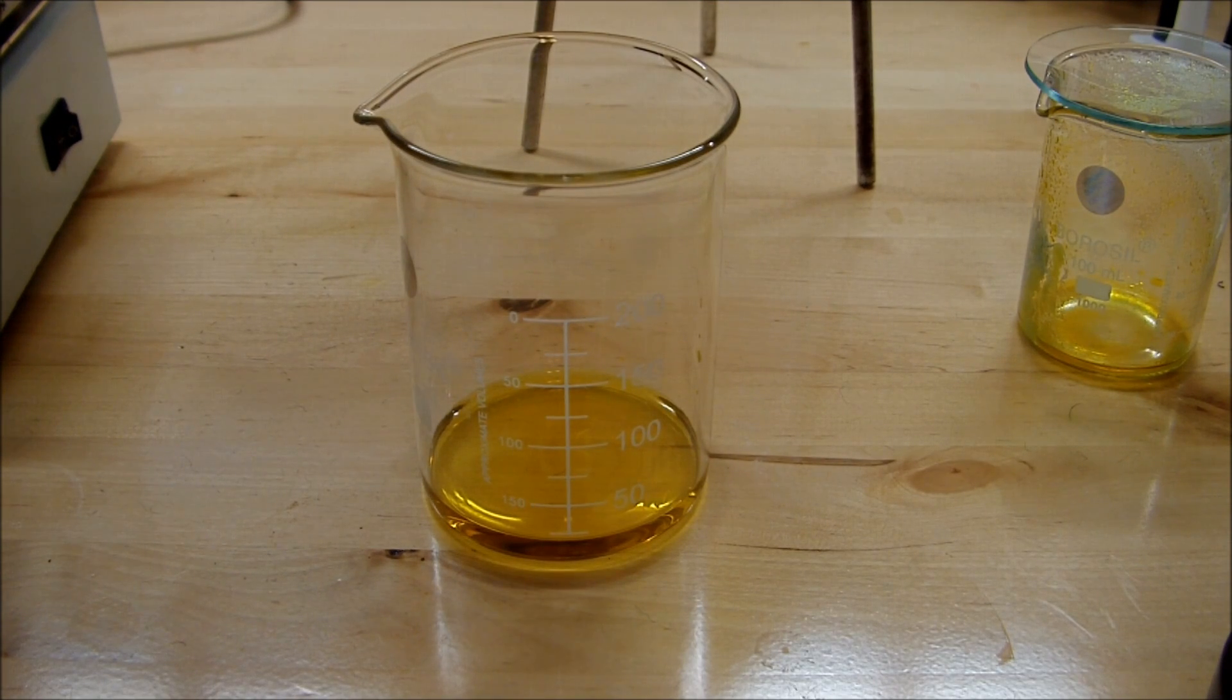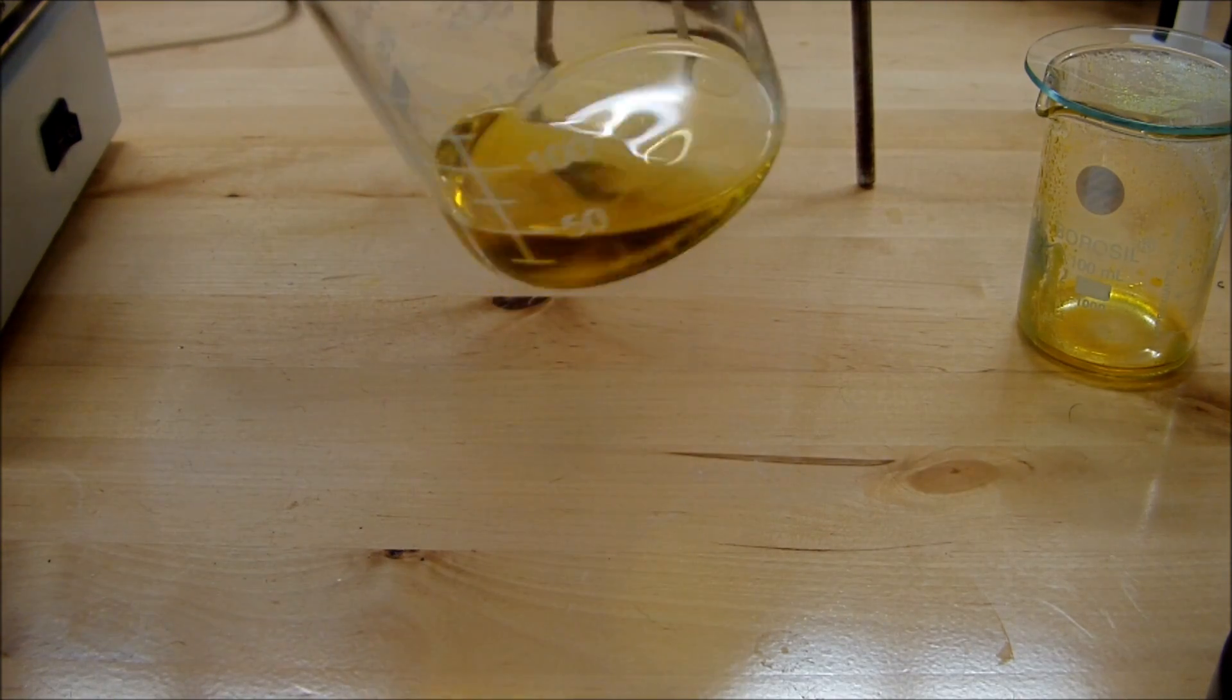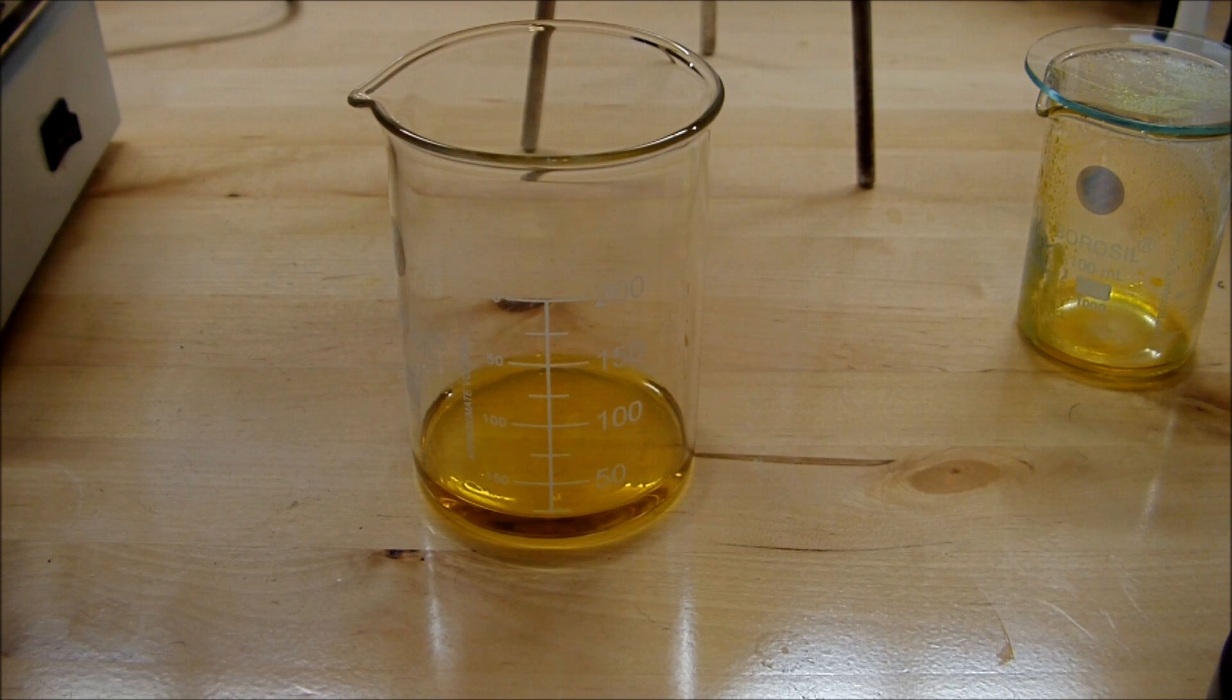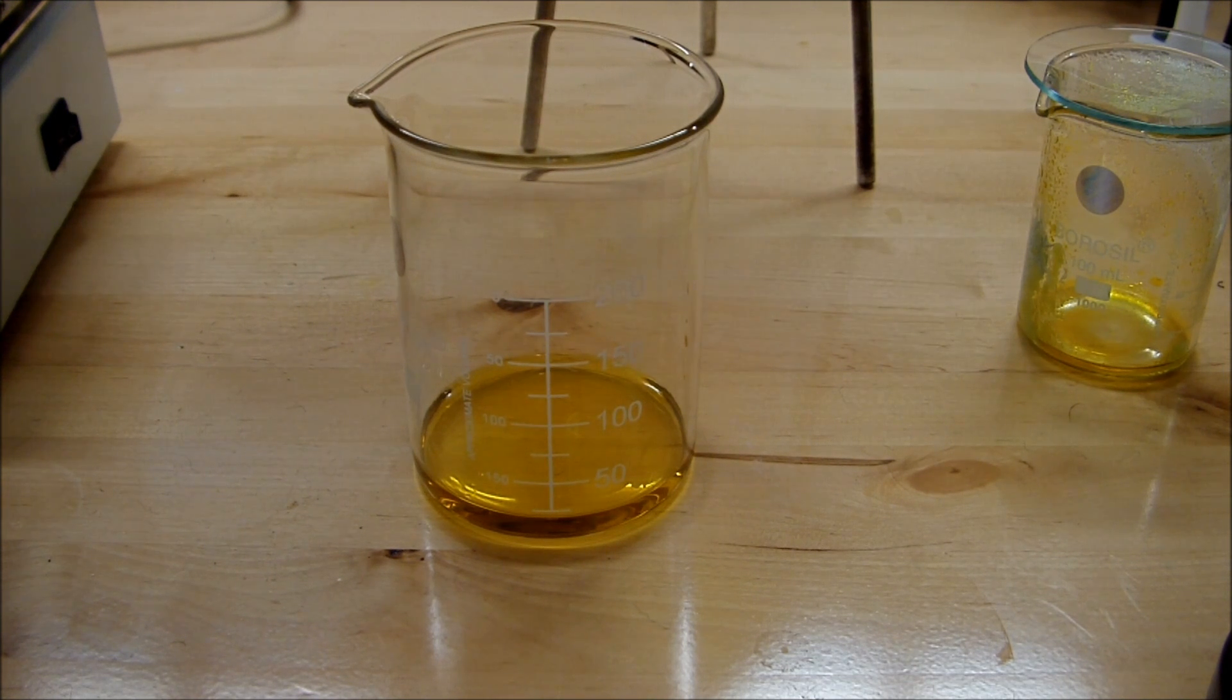I've let my iron 2 chloride solution sit out for a couple of hours, and you can see that it's darkening significantly. That's because iron 2 chloride is pretty unstable, and it very easily oxidizes to iron 3 chloride when just left out in the open like I did.